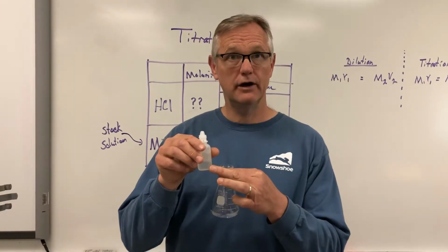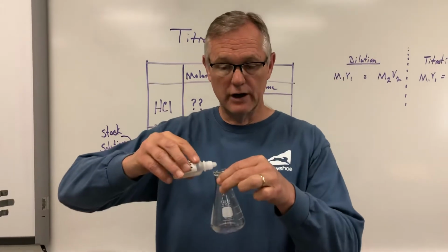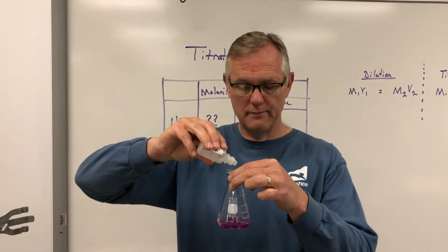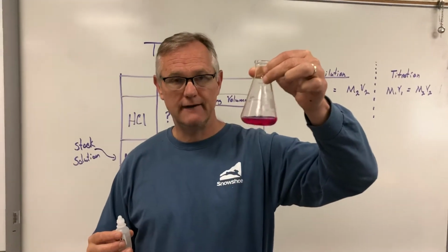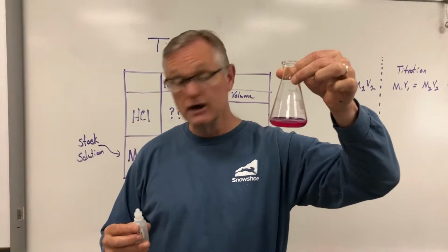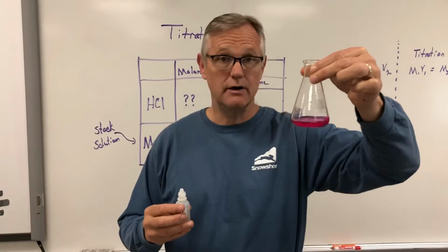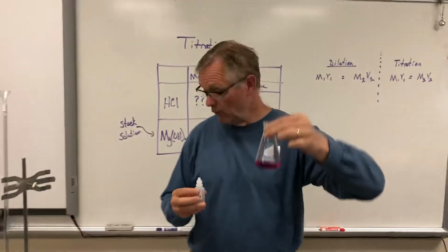It's very, very clear, but once it reaches a pH of about 10, it will go to what we call shock pink. So I'm going to put one drop in here, and you can see that, yes, it went to a very, very deep pink. The reason that we like to use this particular indicator is it's hard to miss. You can really tell whenever you're at the point.